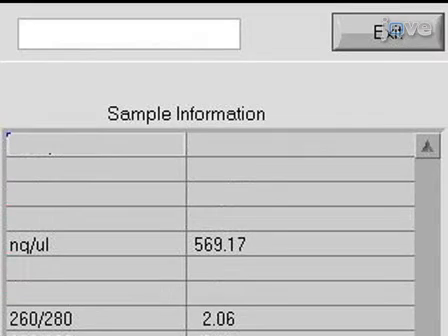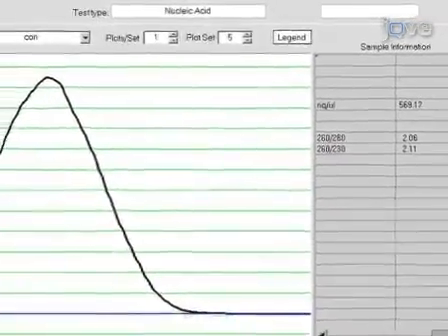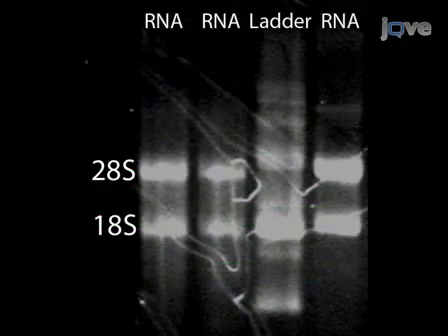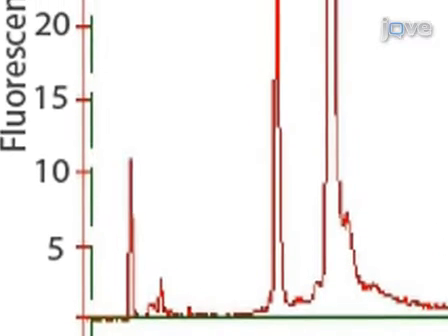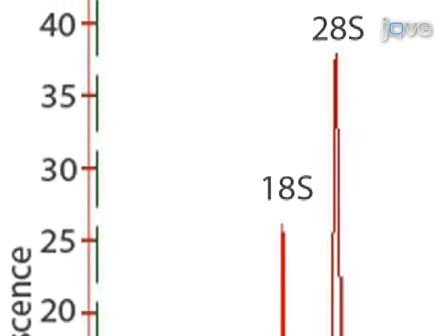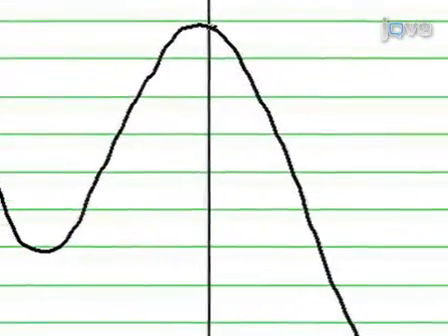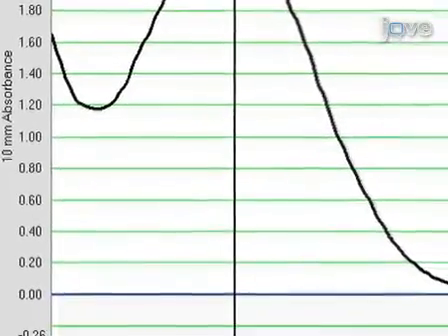Extraction and clean-up of RNA from 50 zebrafish embryos routinely yields approximately 15 micrograms of high-quality total RNA, as assessed using a NanoDrop ND-1000 spectrophotometer. The 260 to 280 absorbance ratio is around 1.9 to 2.0. The integrity of the extracted RNA is evaluated using a denaturing RNA gel, where the RNA appears as a smear with two bright bands corresponding to 18S and 28S ribosomal RNA. The 28S band should be approximately twice as intense as the 18S band. Alternatively, RNA integrity is evaluated using an Agilent 2100 Bioanalyzer, where two sharp peaks corresponding to the 18S and 28S ribosomal RNA are visible and the 28S peak should be larger than the 18S peak. Reverse transcription of 5 micrograms of total RNA routinely yields 1 to 2 micrograms of cDNA, with a 260 to 280 absorbance ratio of around 1.8.